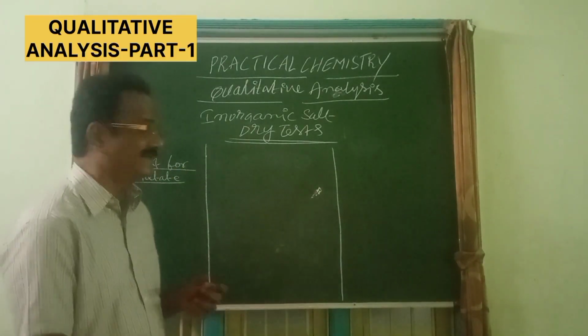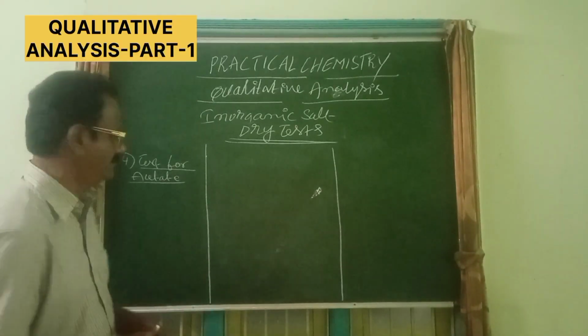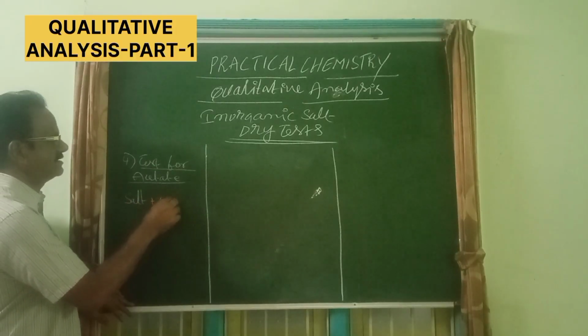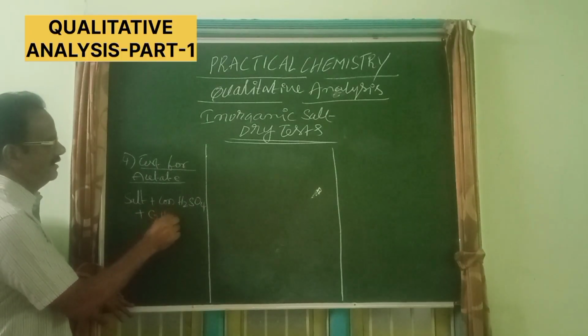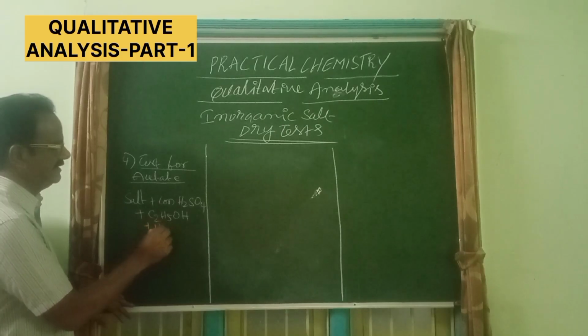Let us see what we have to mix: salt plus concentrated H2SO4 plus ethyl alcohol, followed by heating.